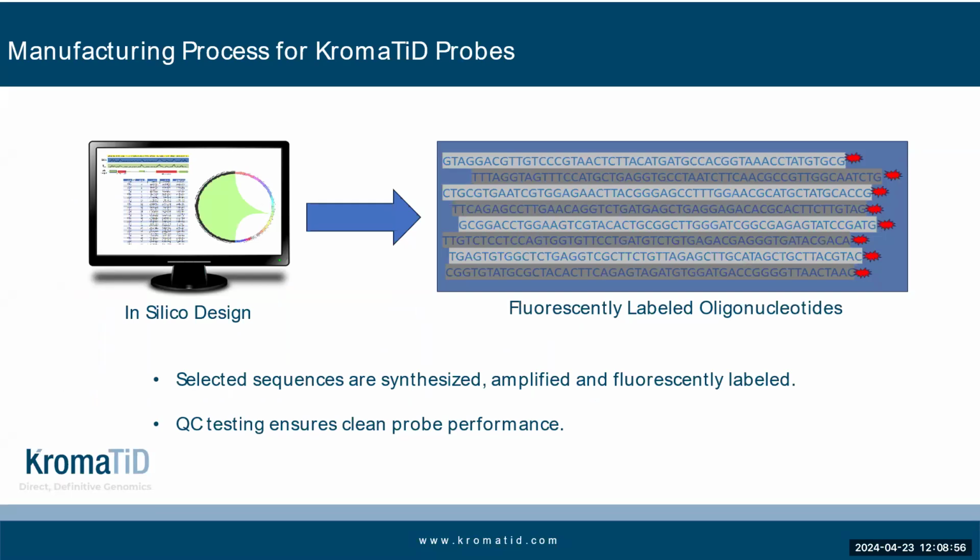Making single-stranded DGH probes starts with bioinformatics. Traditionally, FISH probe sets have been created using bacterial artificial chromosome (BAC) libraries, resulting in double-stranded probes. For DGH, bioinformatics sequence selection happens in silico. Candidate probe sequences with off-target complementarity or problematic binding characteristics are screened out from the start. Ideal sequences, all targeting one strand only, are then manufactured synthetically and fluorescently labeled.